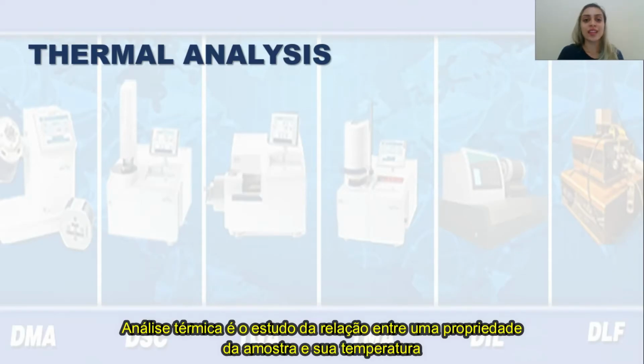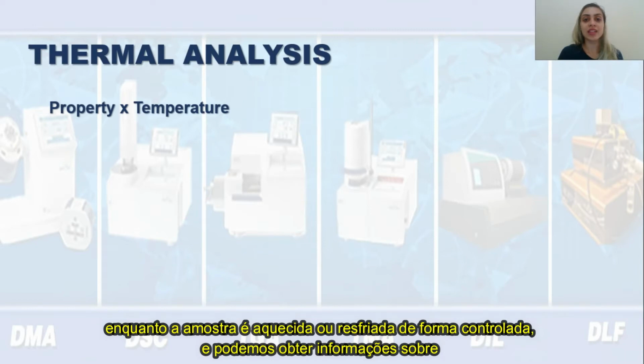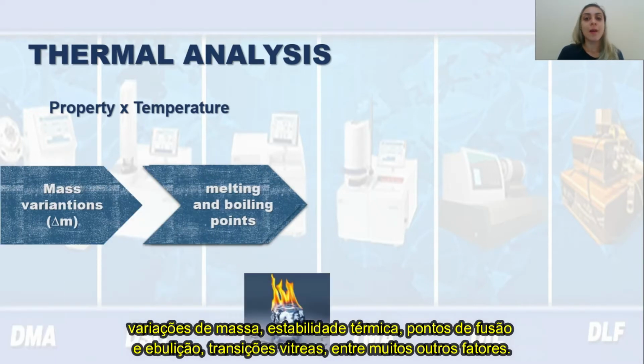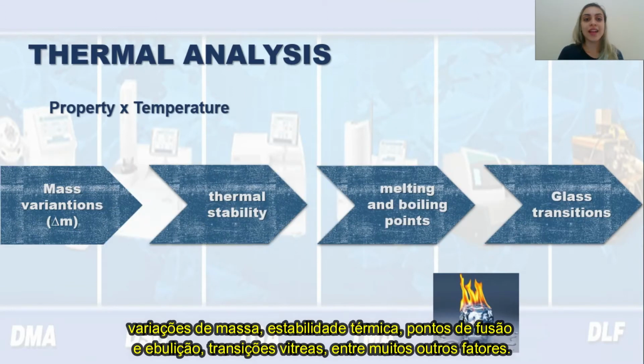Thermoanalysis is the study of the relationship between a sample property and its temperature, while the sample is heated or cooled in a controlled manner, and we can obtain information about mass variations, thermal stability, melting and boiling points, glass transitions, among many other factors.